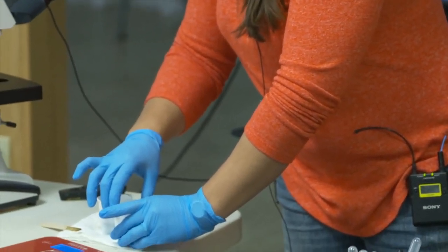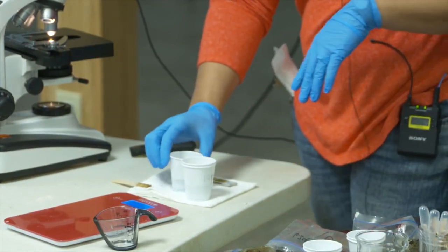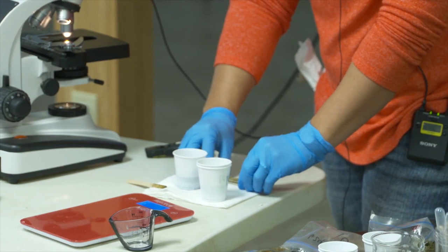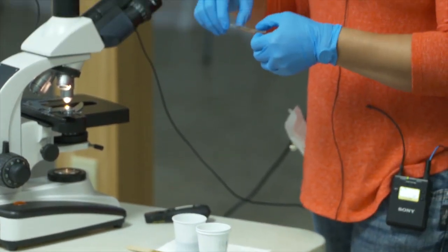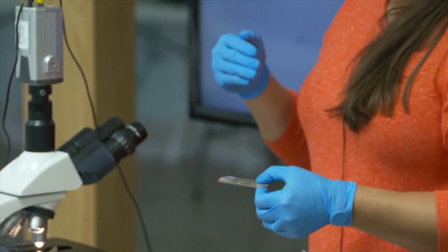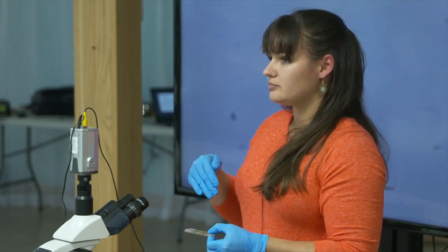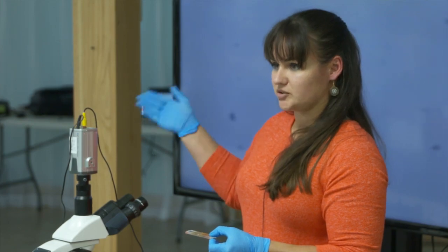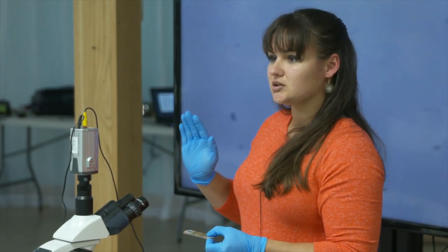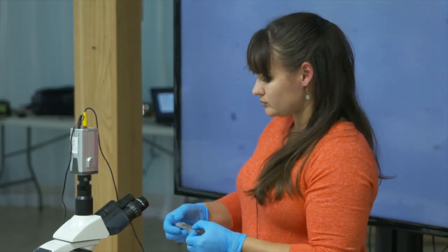Letting it sit five minutes gives the eggs enough time to break away from the fecal manure and rise to the top. Then stir it up again and fill your slide. When filling your slide, don't be overconfident. You've got about an hour before the salt water starts evaporating, causing crystals on your slides, and your eggs will start to sink. Do one or two slides at a time until you get confident; usually I can get through five or six in an hour.